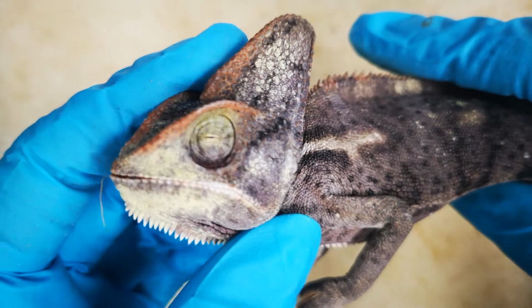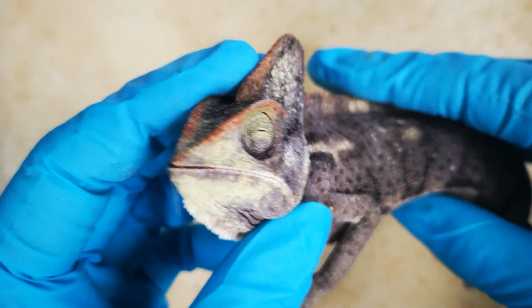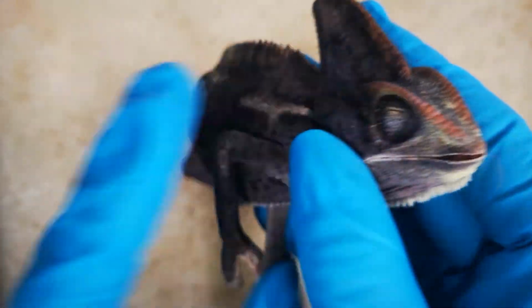On the head, we can observe a series of bony ridges, as well as a pronounced crest of long, pointed scales along the chin. Note that chameleons do not have an external ear. This is a stark contrast to most other squamates. The top of the head bears a structure called the casque. This is formed by elongations of several skull bones and also has important muscle attachments.